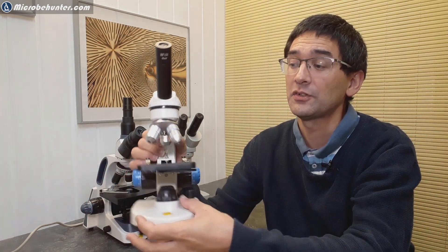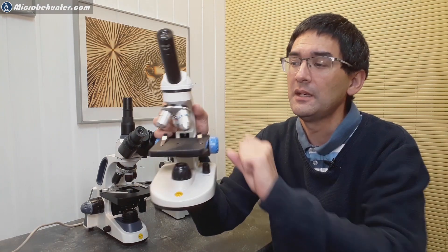Maybe even trinocular so that you also can attach a camera, and of course in this case you then also would have a condenser and also a mechanical stage. Here you only see clips. The mechanical stage would allow you to actually position the slider more precisely and it's simply more convenient. So in this case it would make sense to upgrade because actually with the new microscope you do get more features and the image quality is also going to be slightly better. You have a filter holder where you can play around with dark field.